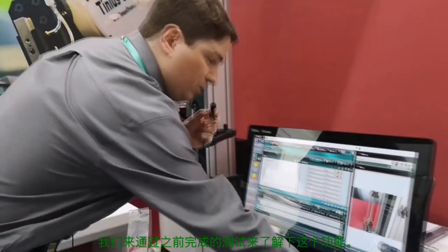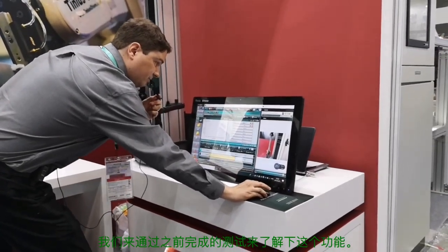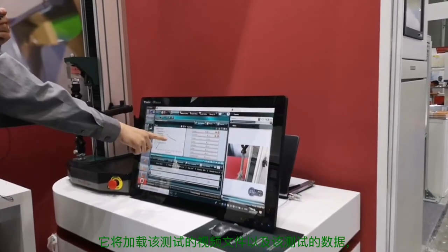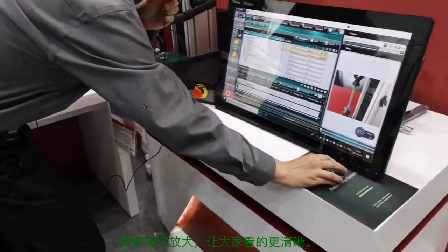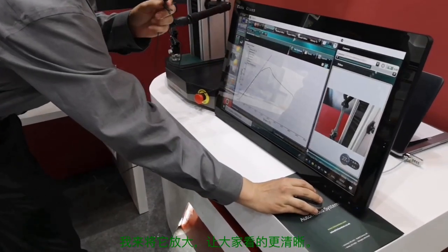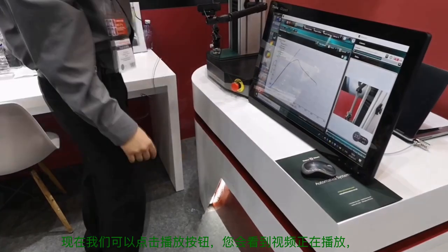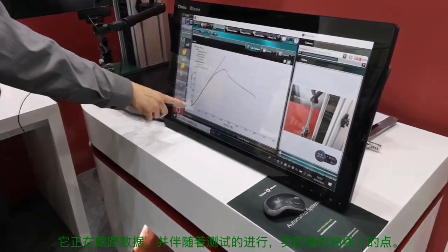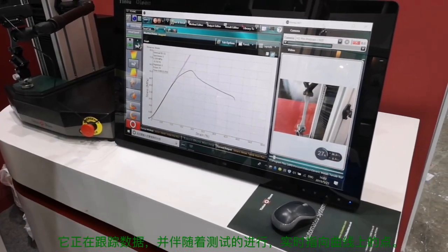At the end of the test — which we won't actually run — we'll go to a previous test that was run. It'll load the video file of that test along with the data for that test. I'll just make this bigger so it's easier to see. Now we can hit the play button and you'll see that the video is running, tracking the data and pointing to the point on the curve in real time as the test runs.